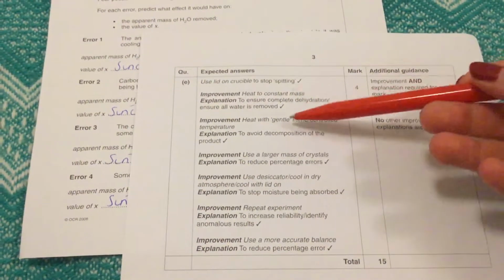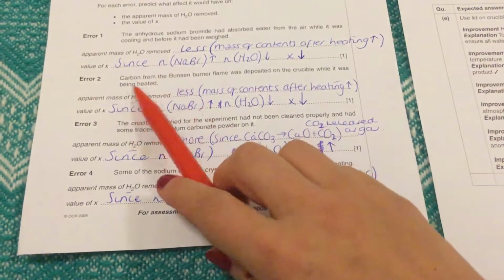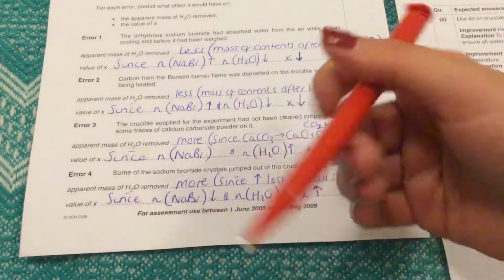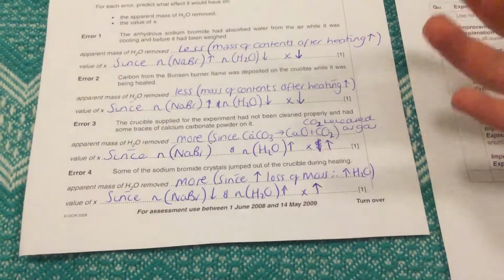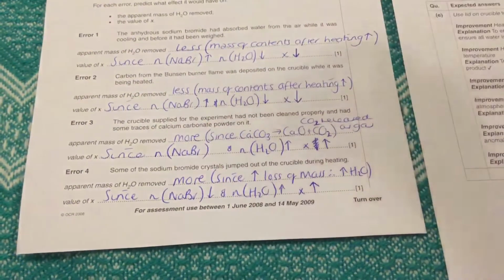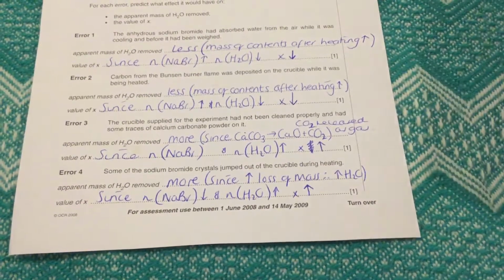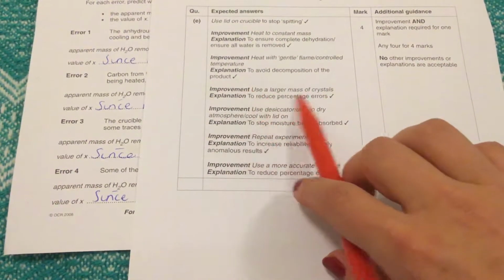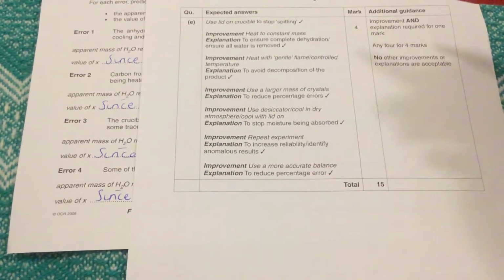The other explanation for this one could be, and this doesn't relate to cleanliness, so this would be okay, carbon from the Bunsen burner flame was deposited while it was being heated. So in this, you would want to make sure that you are constantly heating, but if you're using a yellow flame, you are going to get carbon deposited, so you might want a hotter flame, but to keep that hotter flame further away from the apparatus. So you're heating on a hotter flame, but from a greater distance. Improvement number 4. Use a larger mass of crystals. If we're using a larger mass, then that would mean that our percentage errors are reduced.